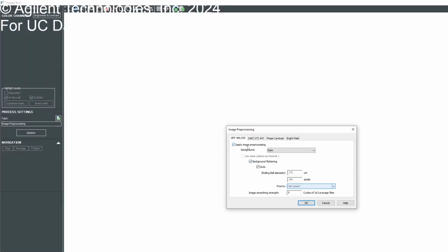And then we want to apply the same processing for DAPI and GFP, but not for the phase and the other one. This is a 20, right? So that's a great point. This is actually affecting the global image. If you set it up to be 20, it's going to try to erase something that's above the object size of 20 microns. So the other one is not going to erase any information, so there we can be more restrictive.